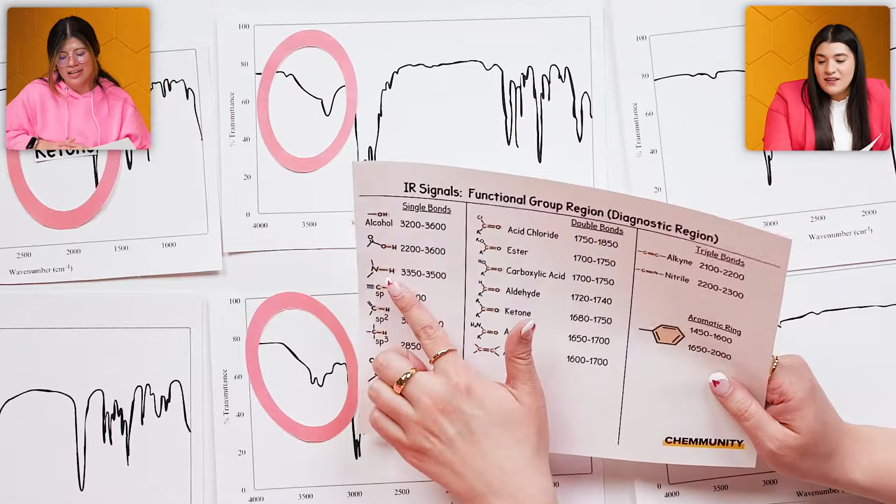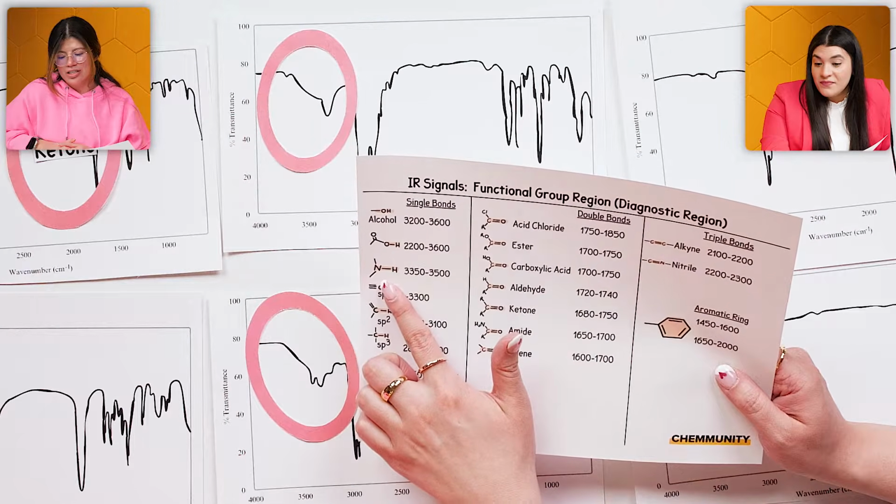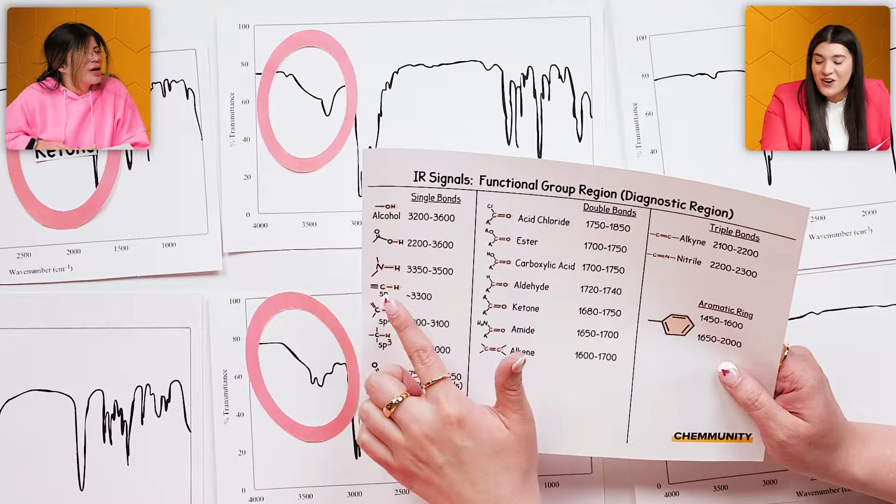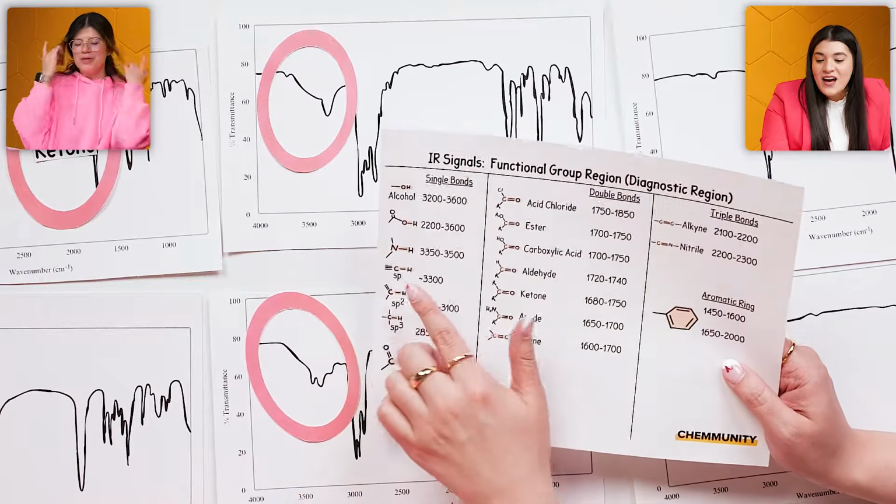This is what type of amine? That's just the primary amine, right? I can't remember. We look at the R groups. Secondary. That's secondary, right. So secondary.